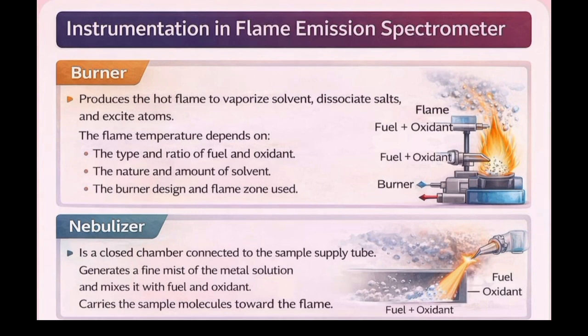The flame temperature depends on: one, the type and ratio of fuel and oxidant; two, the nature and amount of solvent; three, the burner design and flame zone used.